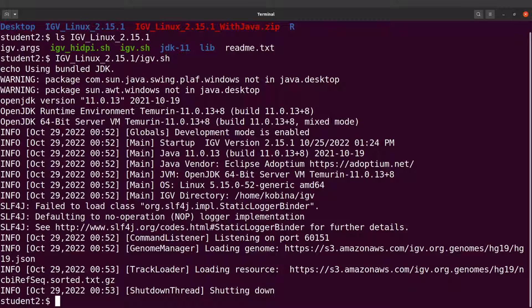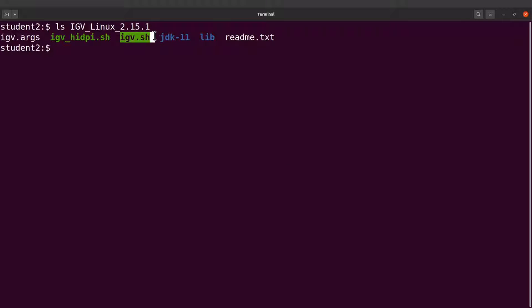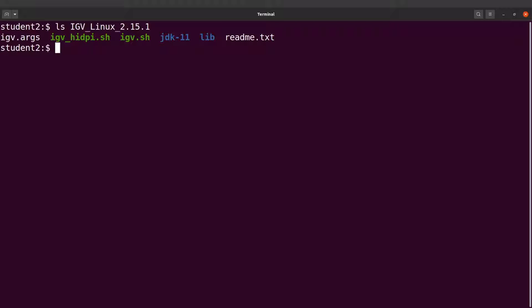With the current settings we always have to specify the absolute path to the igv.sh script. If you are working in a different directory that becomes problematic. We can configure our system so that we only need to call igv.sh from anywhere, without specifying the full path. I'll show you how to configure your system to do that now.